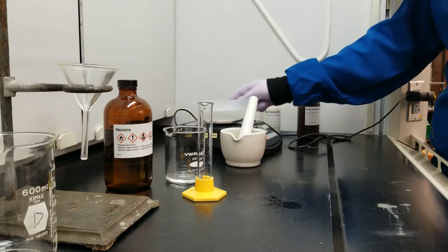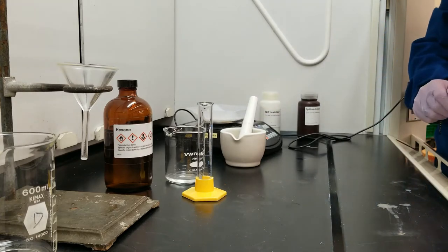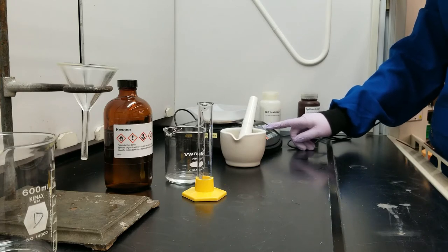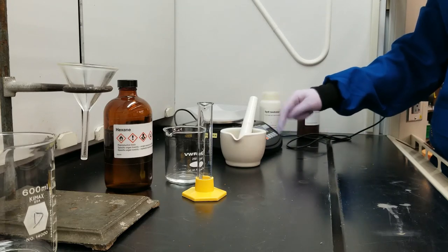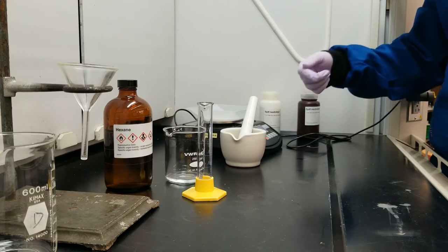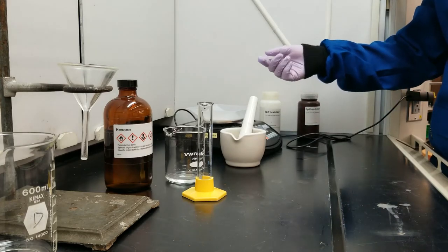So the first thing I'm going to do is weigh out my weigh boat. I'm going to record all the digits that come up on my balance, even if that last digit's a zero. It's still important to establish the precision of my experiment. I'm going to record this value on my data table under mass of 125 milliliter Erlenmeyer flask. They're calling them Erlenmeyer flasks, but we're using weigh boats.